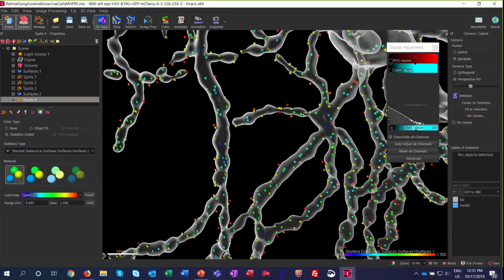And so again, you're able to have your image tell a story about what's happening within your experiment just from a simple snapshot, because not only do we have this nice rendering that gives you more information, but you also have the color coding and the distance measurements that help to describe what's going on within your image. And again, it's because we put these measurements within the Creation Wizards, they're incredibly easy to use, and I hope that many more people start to use them and are able to apply them within their research. Okay.